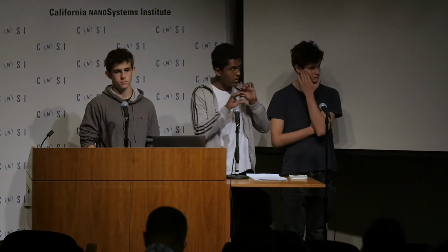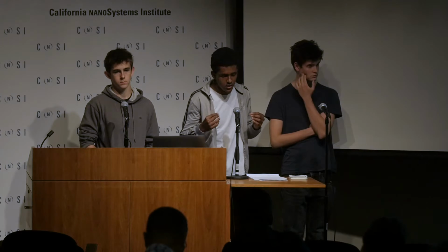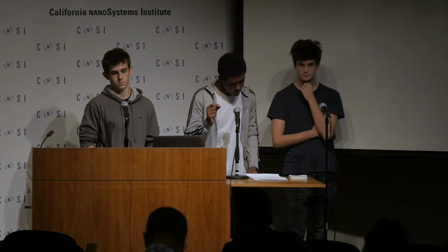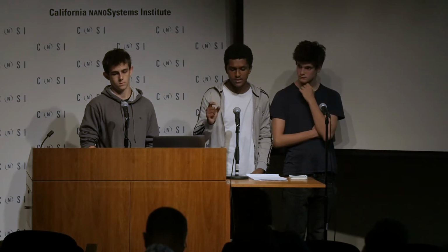So with these two pieces of information, the volume of the solution and the surface area, and also the knowledge that it would form a layer like a cylinder, our goal was to essentially find the height of the layer, which is only one molecule of oleic acid thick.